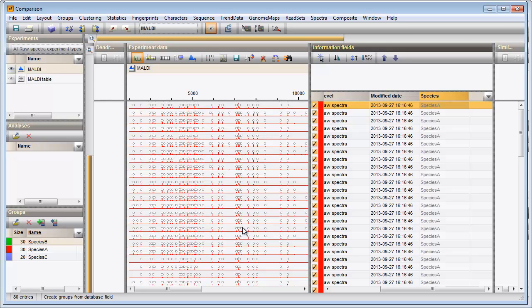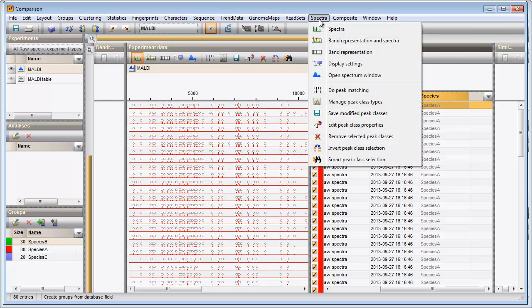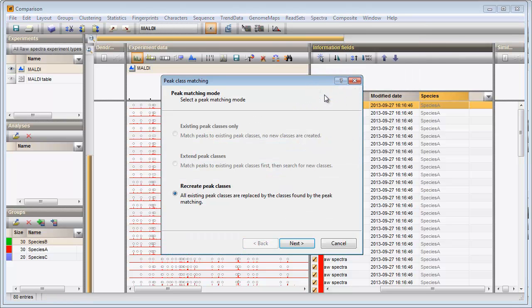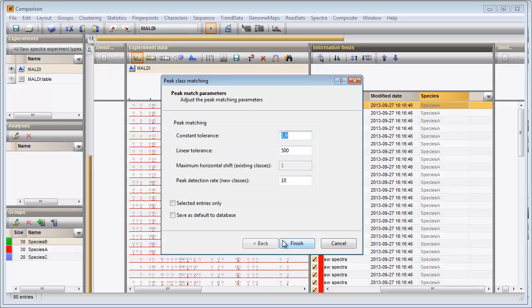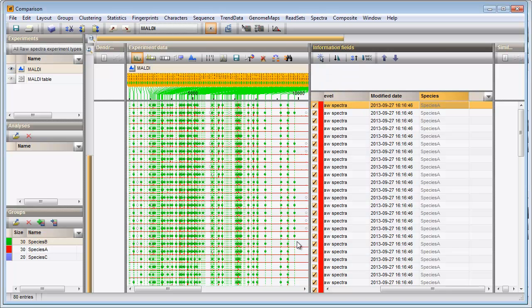Since spectral data can only be analyzed by PCA if a peak matching has been calculated, I select Spectra, then Do Peak Matching. The peak matching for our MALDI experiment is displayed in the Experiment data panel.